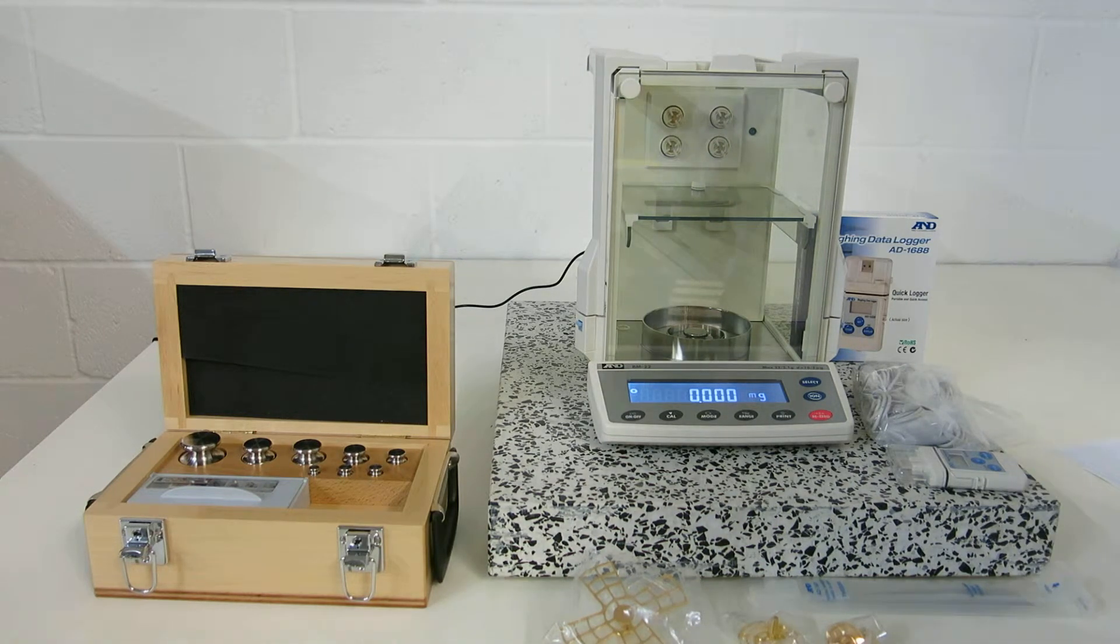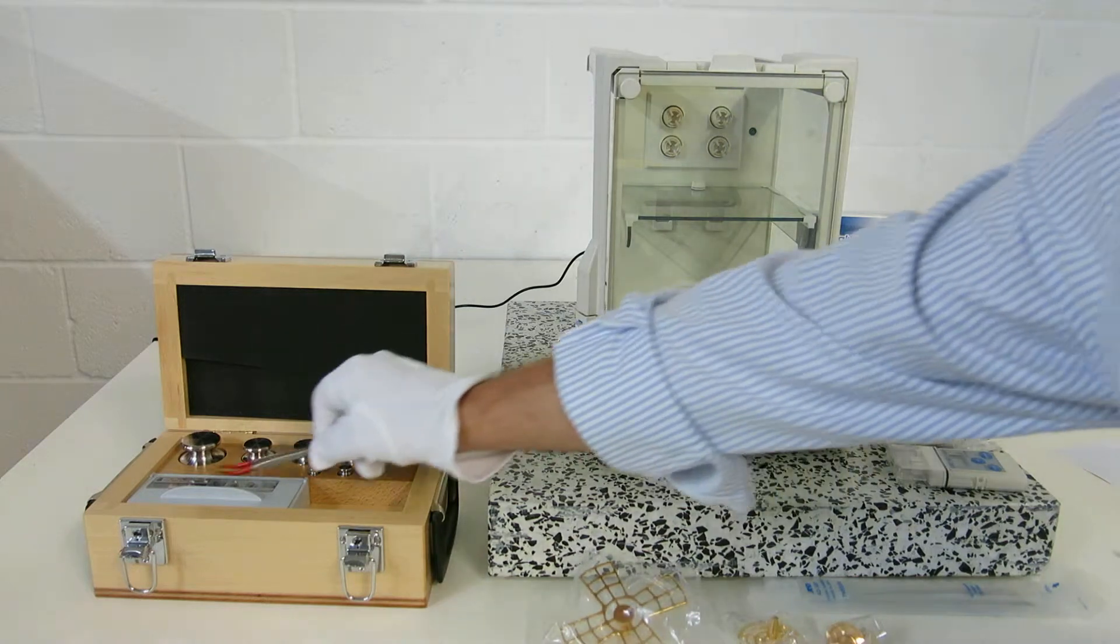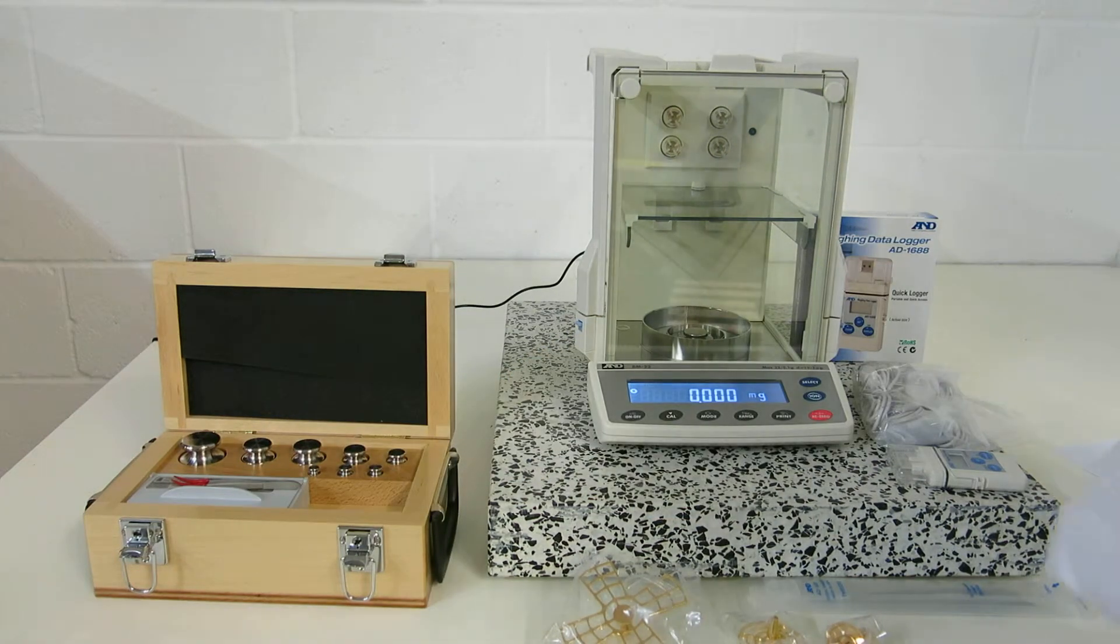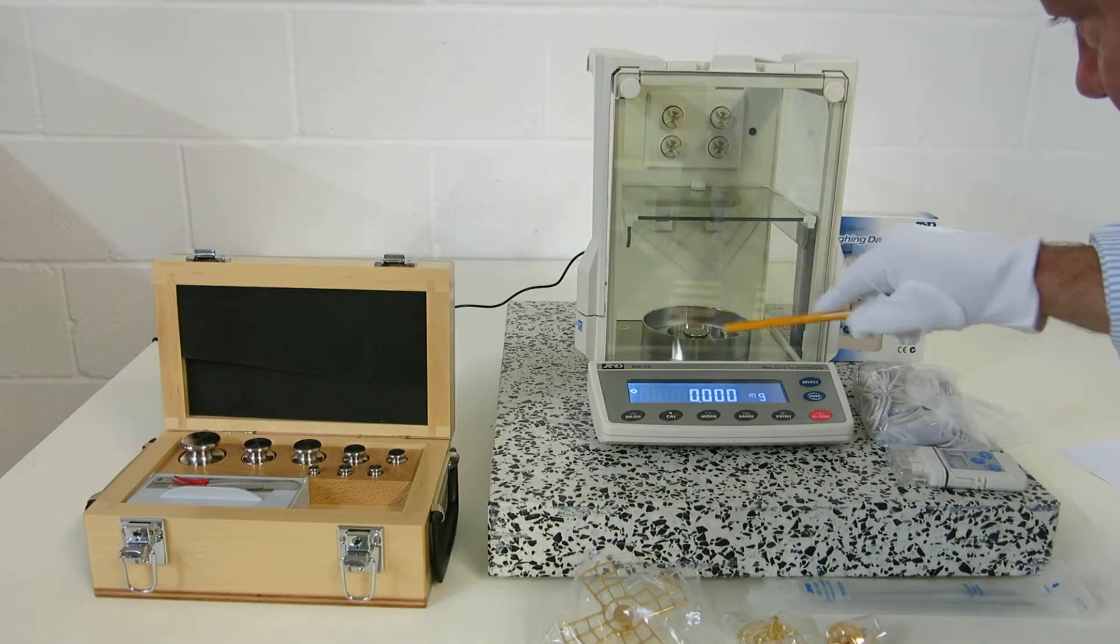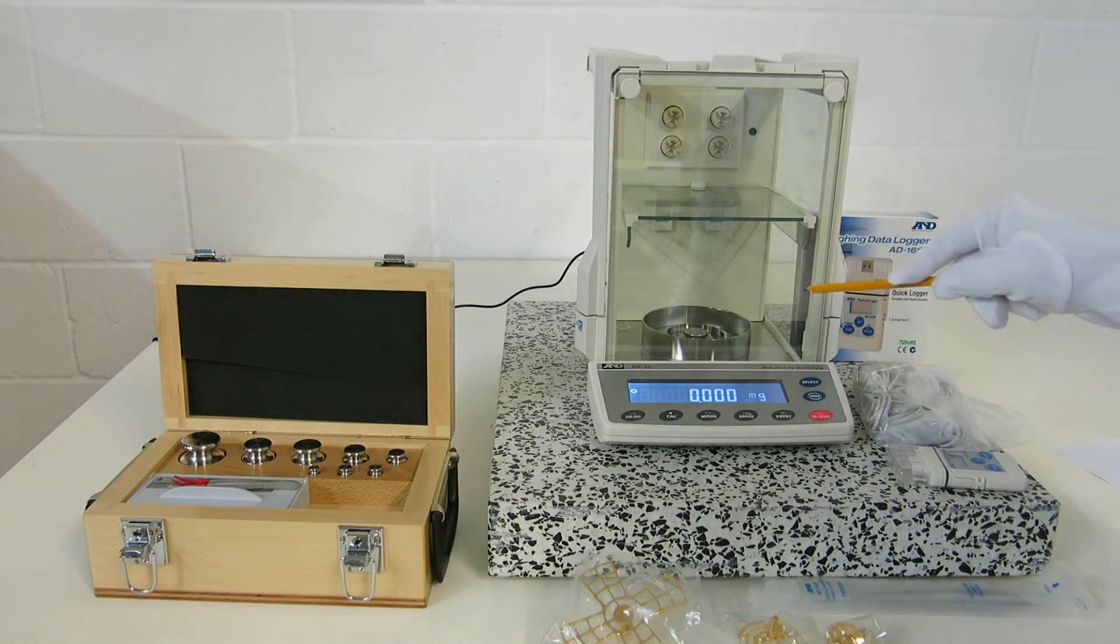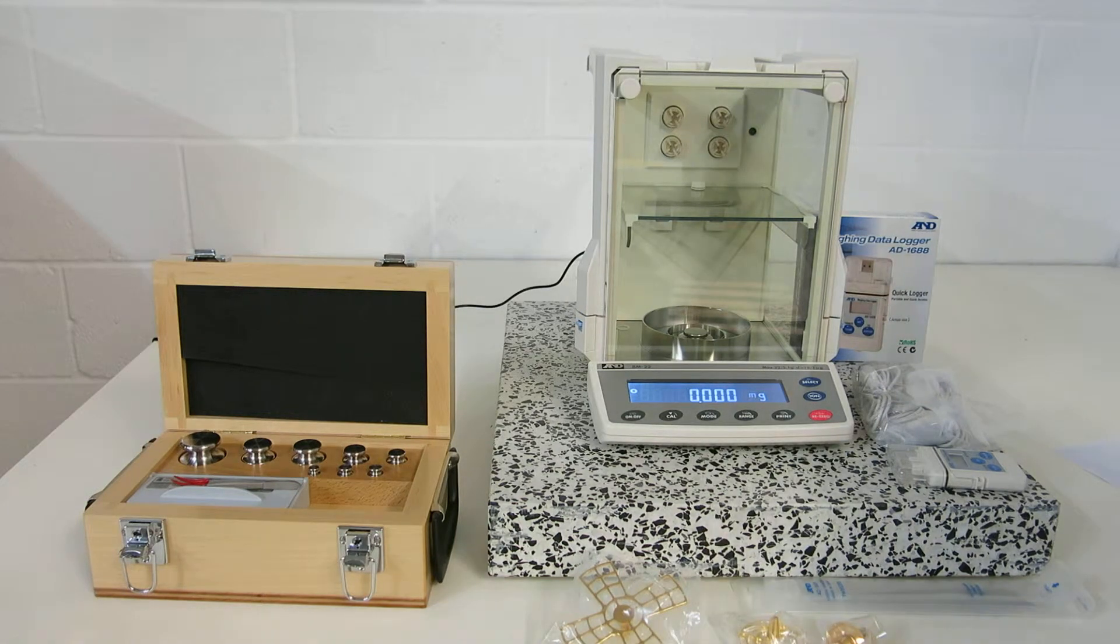As you can see, it's 5 and 6 decimal place. This particular model has this double breeze break facility here, which eliminates drafts, and it's anti-static. It's got a metal coating on it which blocks outside electricity.